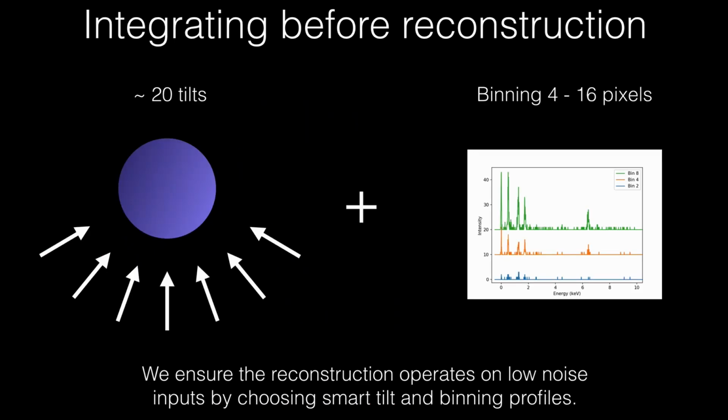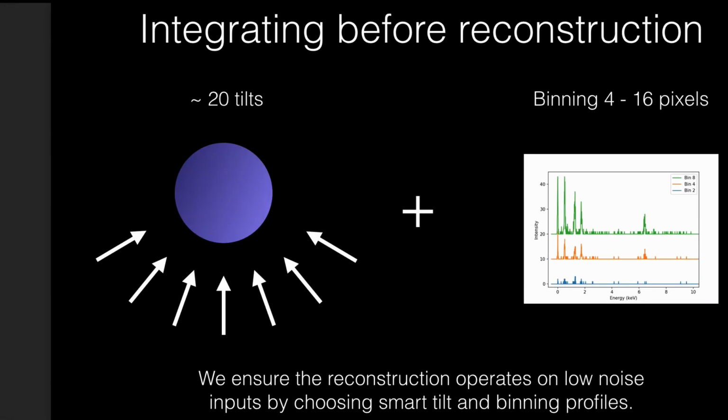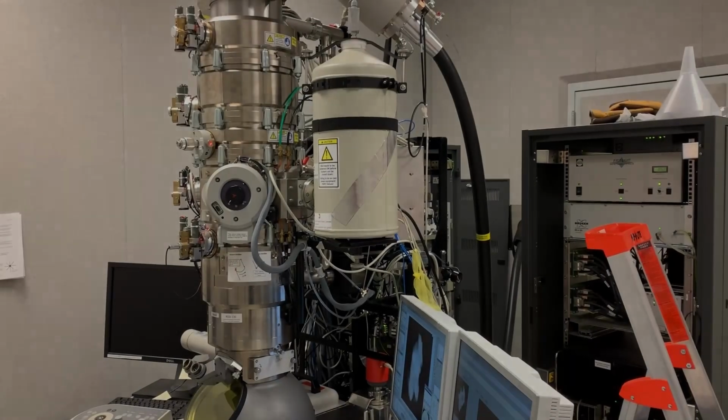Okay. If you're interested in these slides, you can also ask me for them. And then this now gets into the tomographic reconstruction. But before we go there, let's talk about how to do the acquisition in practical terms.